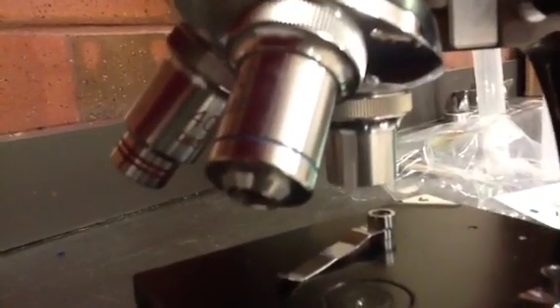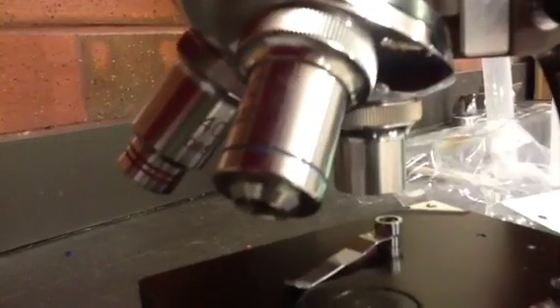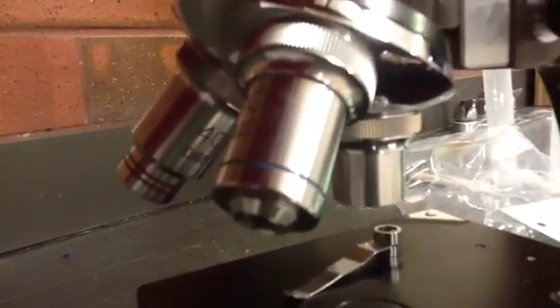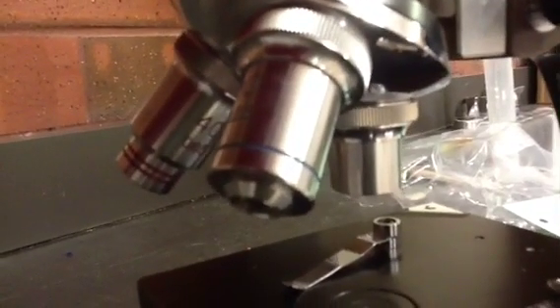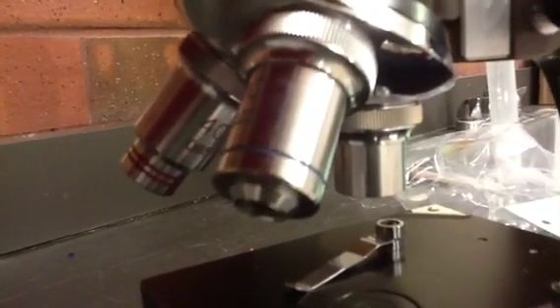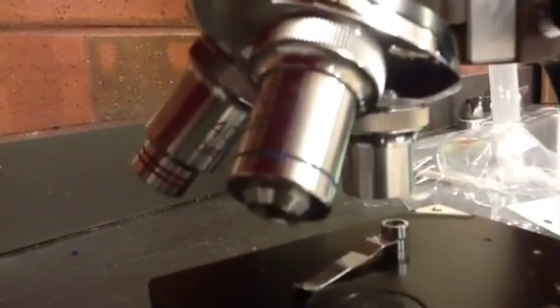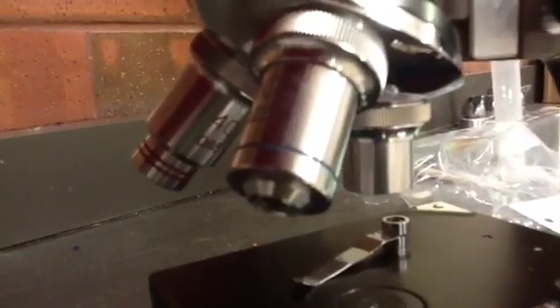These are the objective lenses. These can be changed in order to change the magnification on your microscope. You can see the one on the left, if you look closely, has a 40 on it. That's the high power. It has a magnification of 40 times. The middle one has a magnification of 10 times, and the shortest one has a magnification of 4 times.